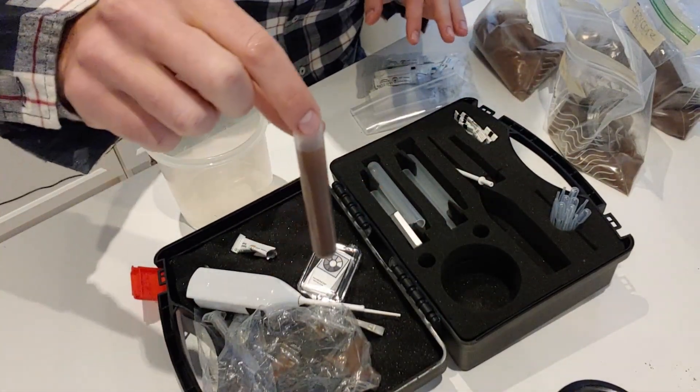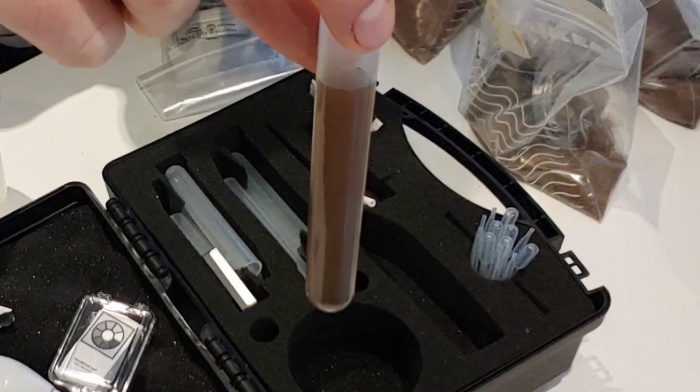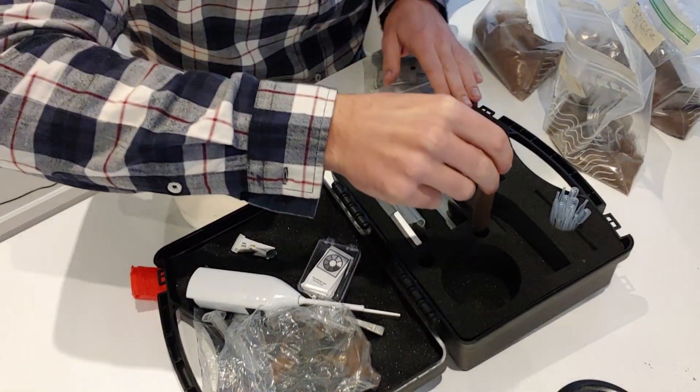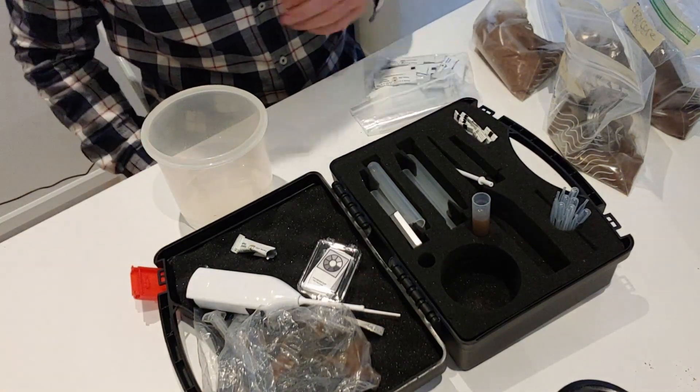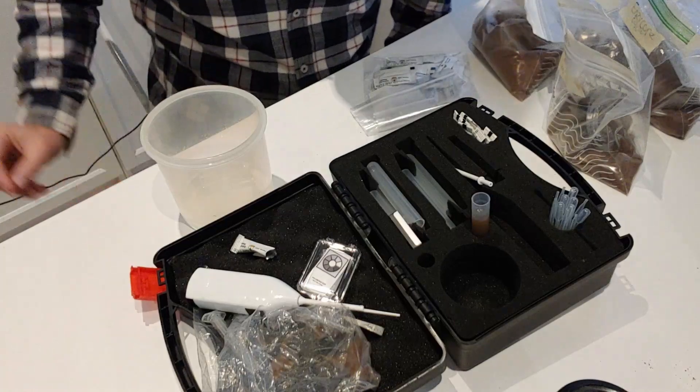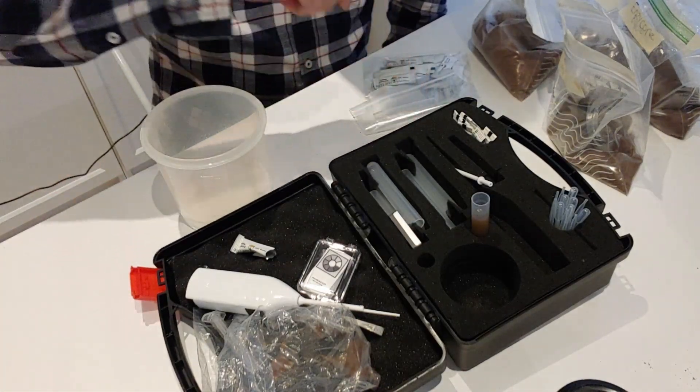You can see that all of the soil is now suspended into the extraction fluid. I've set a timer on my mobile phone for 20 minutes — it needs to sit for 20 minutes before we can take a dropper extraction and put it onto our test.